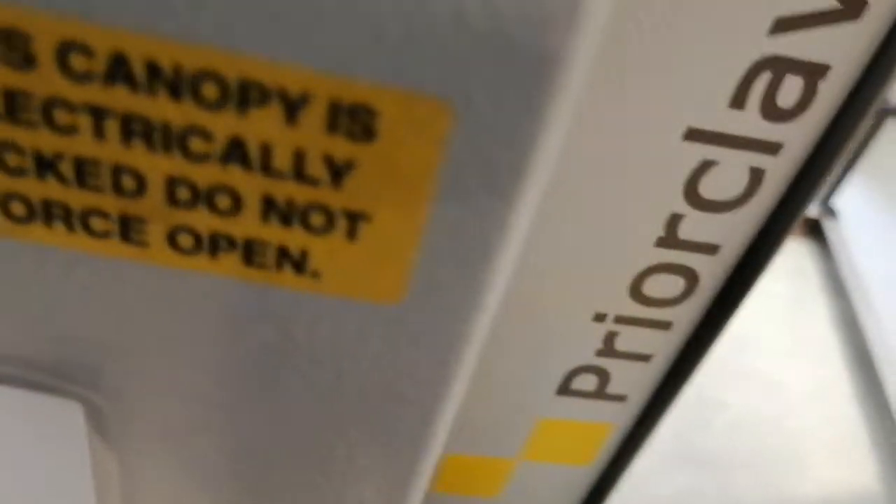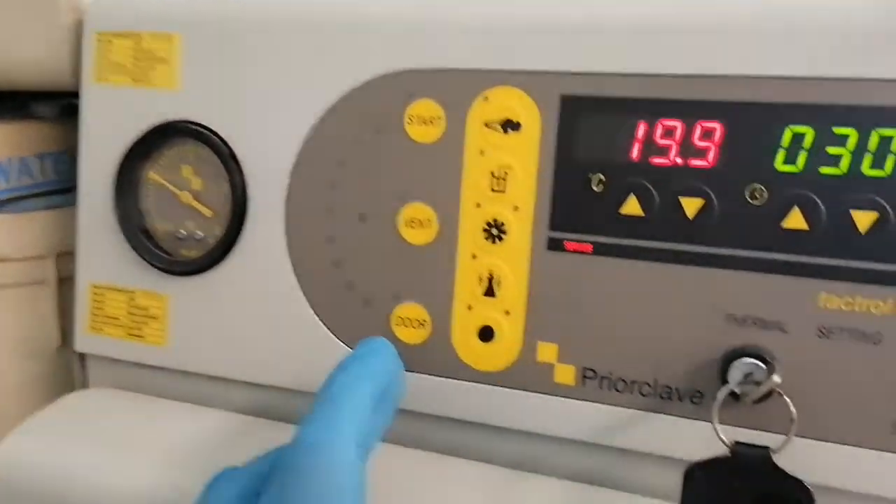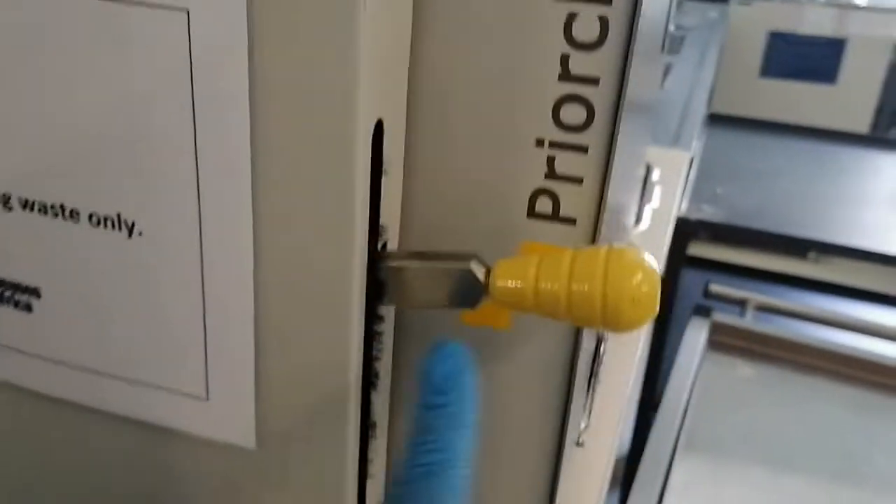And then you close the door. Push it down, then press the door button. You wait for that click, and then you pull down the lever.